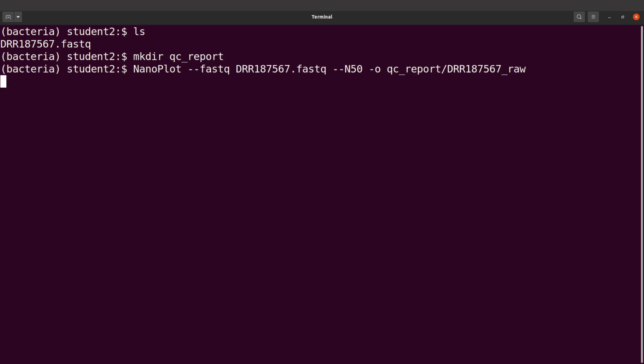Okay, so this command, when I executed it, took about 1 minute. So you should also monitor the time. It will take maybe around the same time to complete. So let's wait for everything to get done for us. All right, QC has been performed. So let's do an ls. We are going to find our directory here.